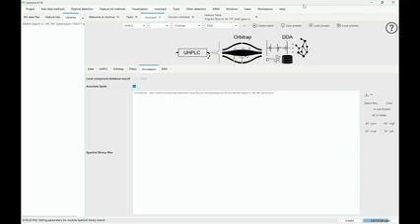It's kind of a problem with the old NIST module and the tool that they provide. Someone implemented that. It's also, I mean, a community effort, right? So someone implemented that method and then never really maintained it. And I mean, we try to maintain all the modules in there. It still works, but it was very limited in scope. So yeah, he didn't implement all the methods they have in NIST MS Search. And also, there's a limitation by the tool that, again, we cannot review the quality because we cannot get the spectra out because they forbid that. But we're working with them on some solutions, so it might be coming in the future.